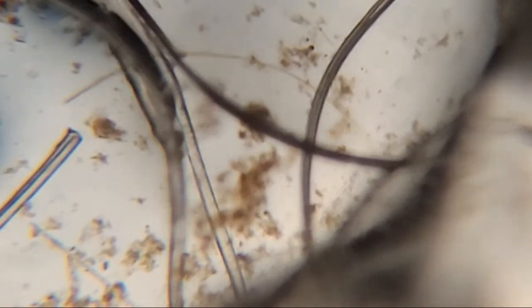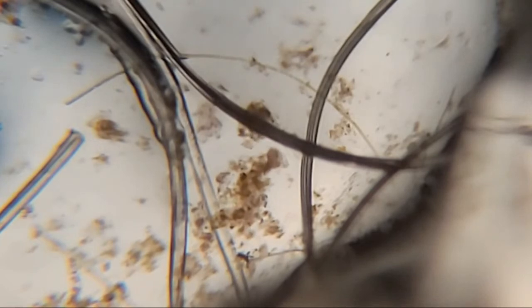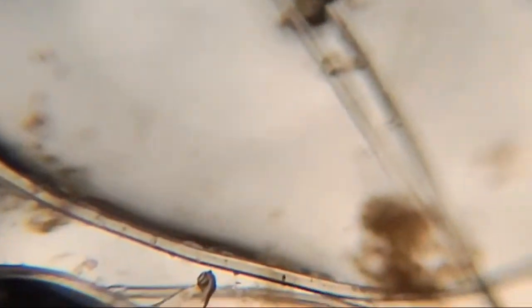I'm not finding anything other than debris really. Oh, we got something here — what is this? A little worm? A little paramecium or worm? Some little clear worm, doesn't look like a flatworm. Munching on something and in that twist of malm. This is only a few-week-old aquarium with some older plants but I didn't try to jumpstart it per se. We see filamentous algae — we don't see a lot of bacteria or fungi growth, or even differentiating the malm that much.